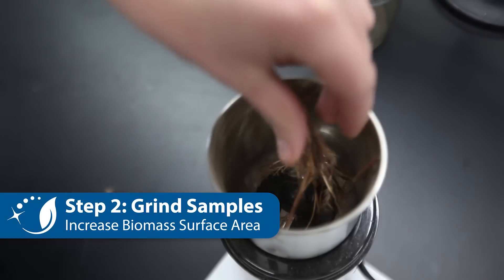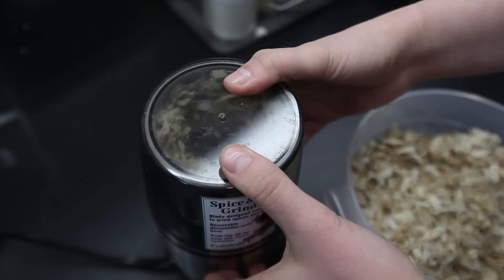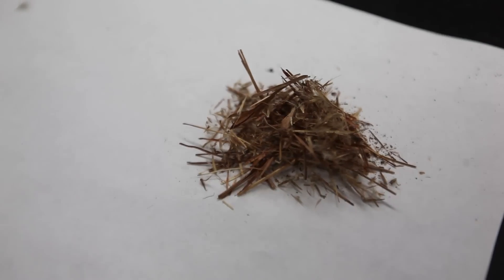The next step of the lab is to grind the biomass samples into small particles and add them to your test tubes. A standard coffee or spice grinder works well for this purpose. Here you see it go to work on the samples we collected, even cardboard. The goal is to increase surface area.